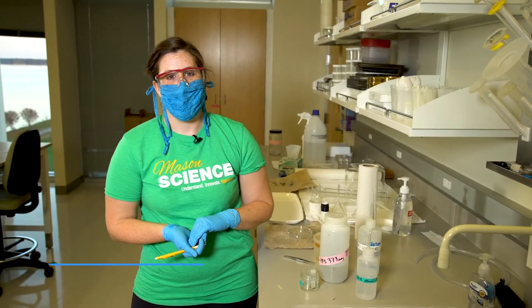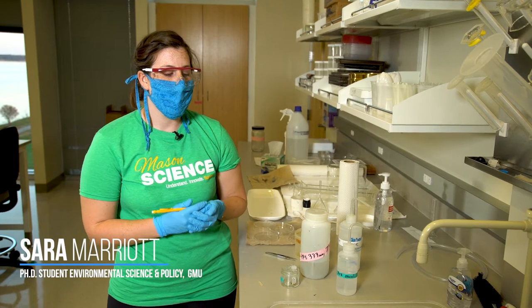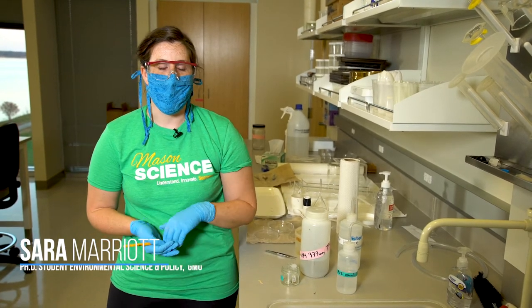Hi, I'm Sarah Marriott. I am a PhD student at George Mason University and I'm going to show you guys how to sort your larval samples that we collected from the field.